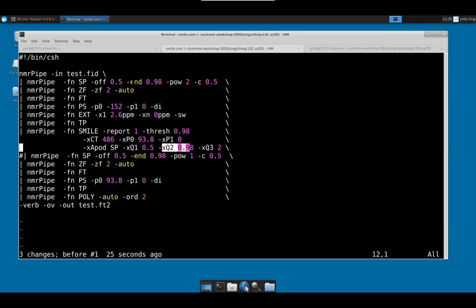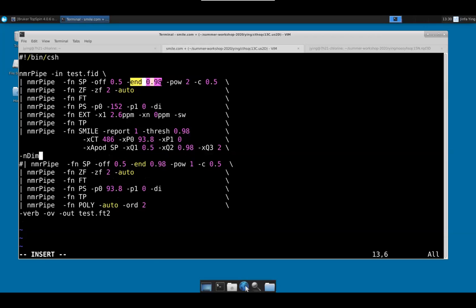No, the number of dimensions, I believe. Oh, ndim, this one? No, it should be 2. It's the total dimension of the data set. Nowadays the new version automatically figures it out from the header, so you don't need this information. That's why I don't specify it. But some of the example files use the older version, and you need to enter it before SMILE can run.